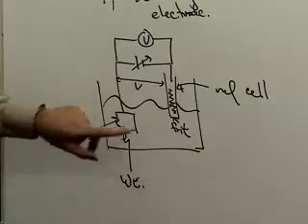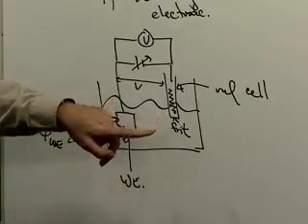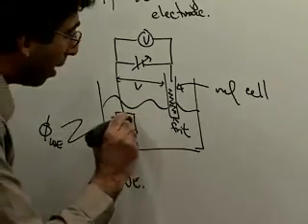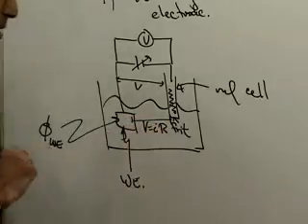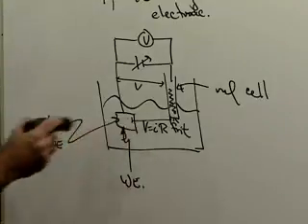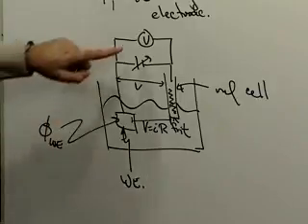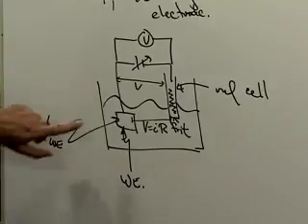A second problem you might have is this little frit down here. If there was a high resistance in that frit that connects you to the solution, then you do have a comparable voltage across the solution, which is the current times the resistance, and that could be a big number if you had a big resistance and a decent current. And so this voltage would not actually then represent the potential of the working electrode.